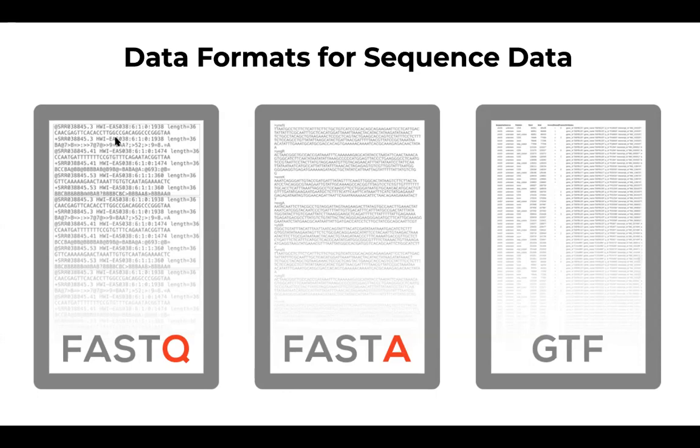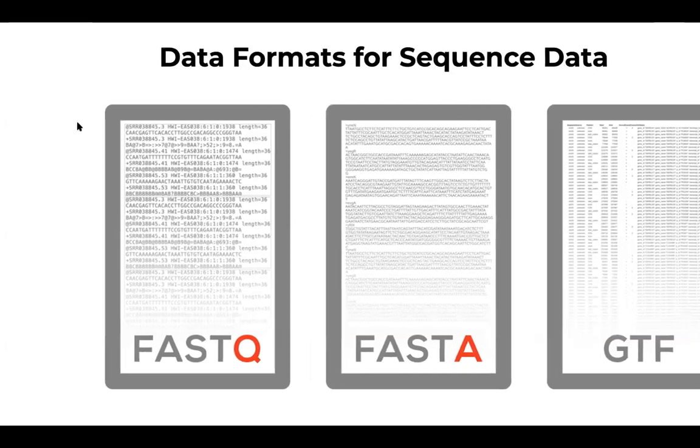So those steps matter. One of the ways that we can make sure that the initial raw data is high quality is by going through some pre-processing steps. It's important to understand the logic behind these different pipelines as we look at how the data was prepared, and we think of the objective. Where do we want the analysis to go?